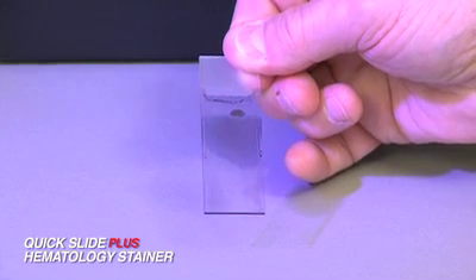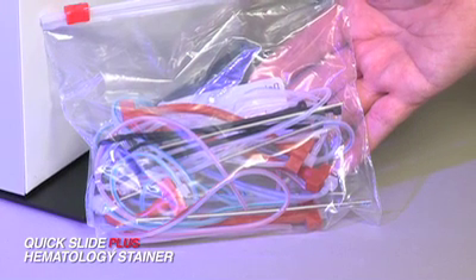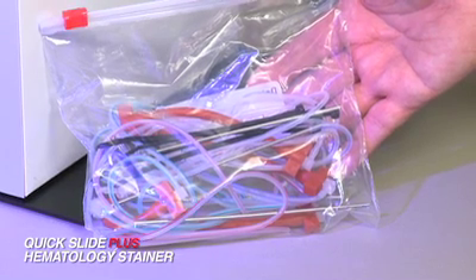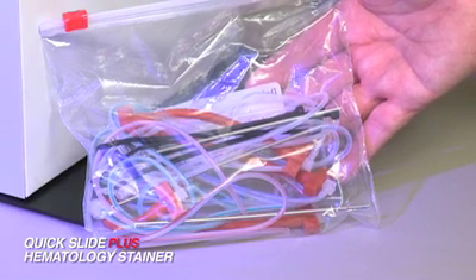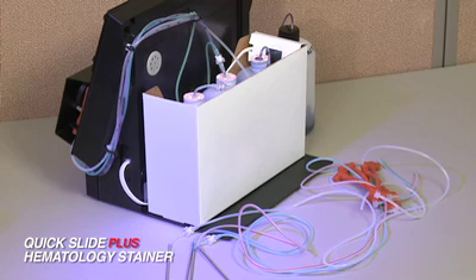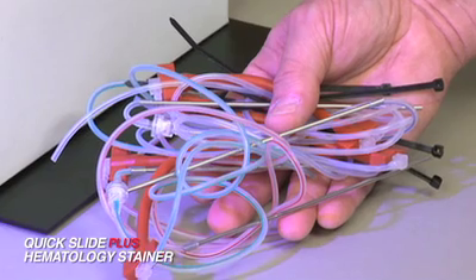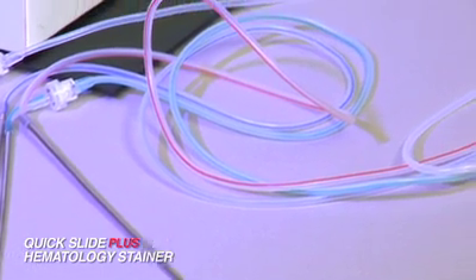No priming is necessary. As to maintenance, GG&B recommends changing the tubing kit once annually. Tubing kits are complete front-to-back replacements with color-coded lines, pump tubes, tubing elbows, check valves, stainless steel cannulas, and wire ties to connect lines onto the unit. No daily preventative maintenance is required.